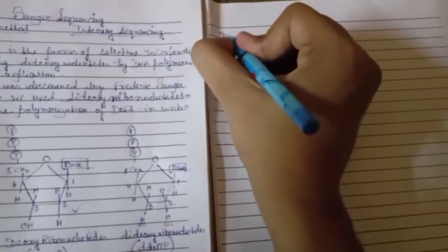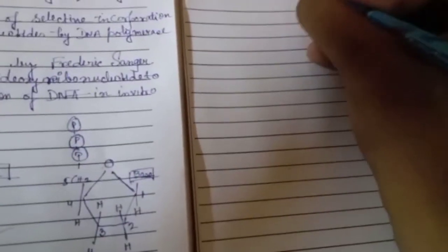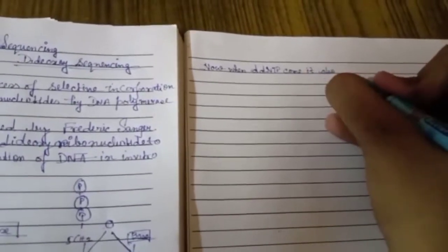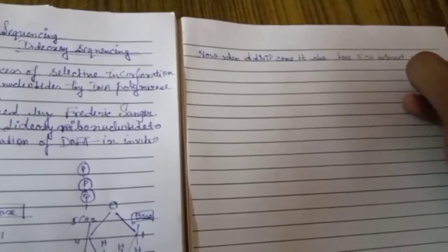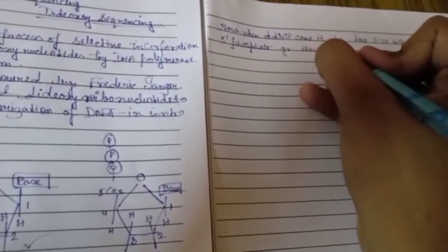Now, when a dideoxyribonucleotide or ddNTP comes, it also interacts with the 5' phosphate group. The two phosphate groups are removed as pyrophosphate and they create a phosphodiester bond.